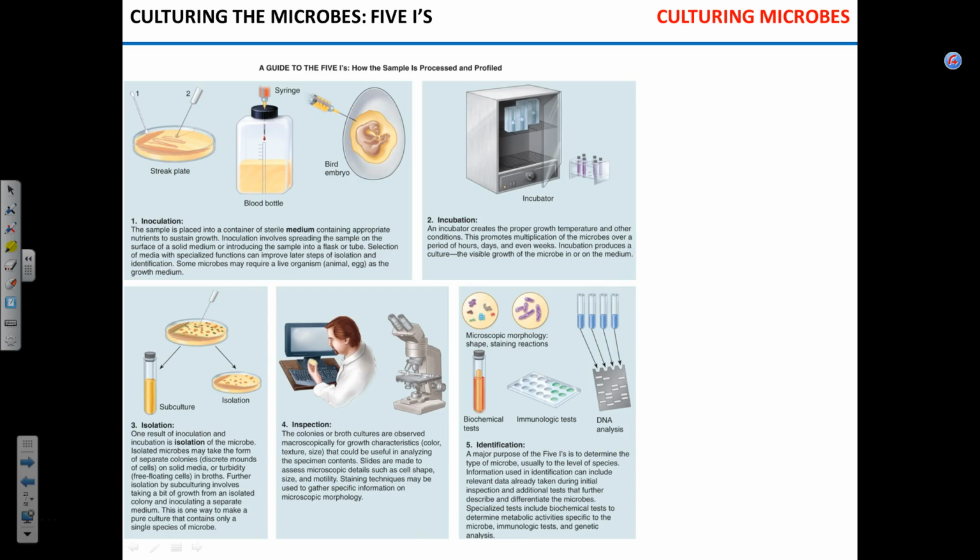Okay. Let's move on. The next topic, a very interesting topic that we're going to chat about, is how we culture the microbes. So why do we need to do that? Why do we need to culture them? What's the purpose of culturing microbes? In what sense? That's right, yeah, a better sample. So we can see them, right? Maybe we don't have enough, so we need to have more.